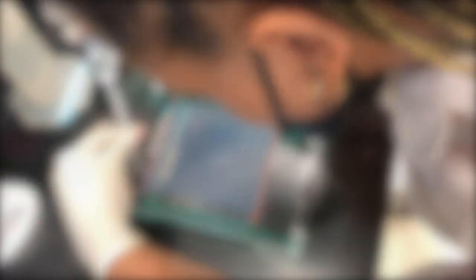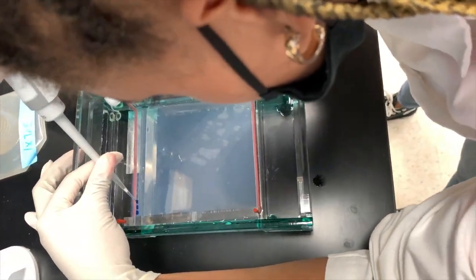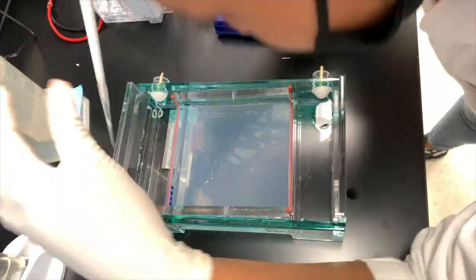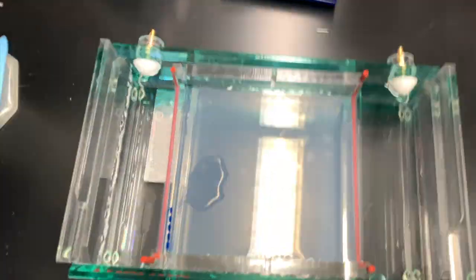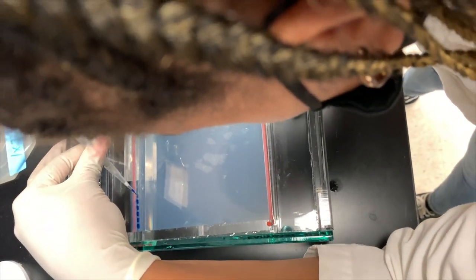Now we're going to show you a time lapse of us loading our extracted RNA into our agarose gel. We are loading our samples into the agarose gel wells, getting ready to run it. Once we run it, we can then put the agarose gel into a gel documentation machine to look at the bands of RNA.